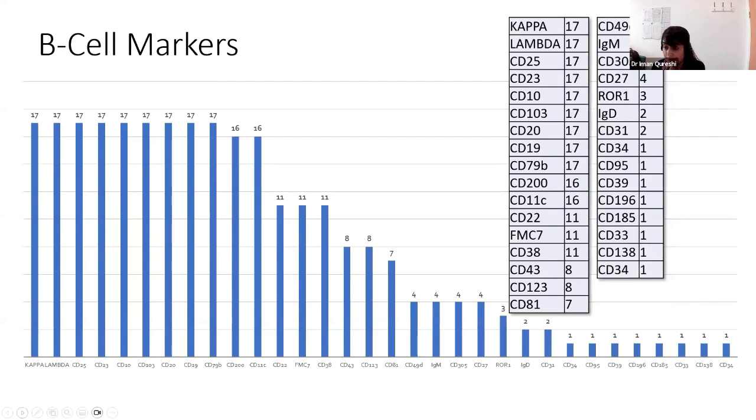So now I'll discuss the BLPD results. Again, a big graph is coming up. And just to reiterate, we weren't looking at plasma cell diagnosis. We were excluding the plasma cell panels. And these are the results from the 17 labs for their BLPD panels.